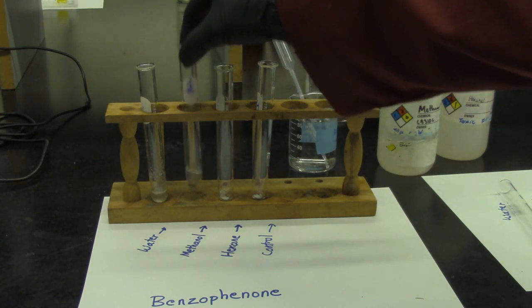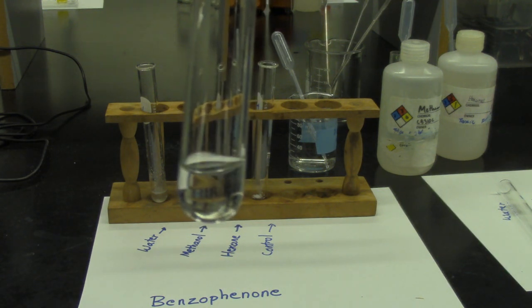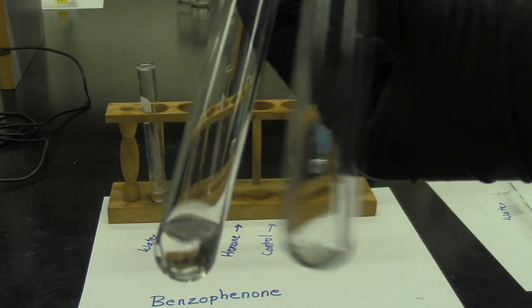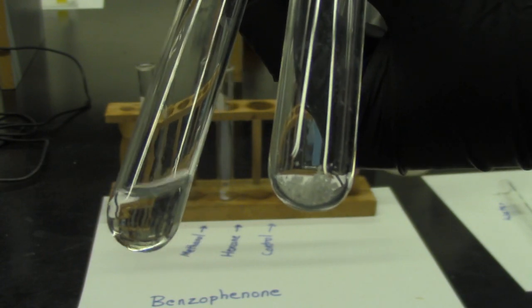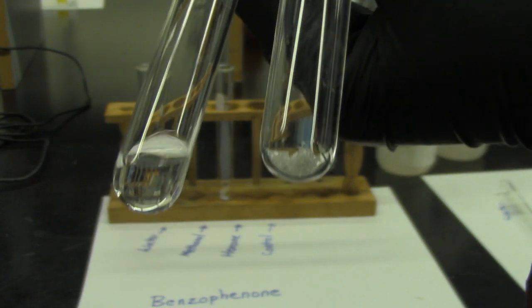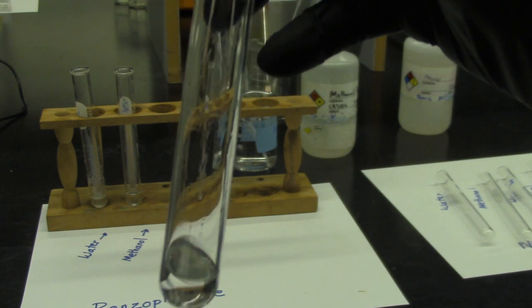To test tube number 2, I've added methanol and stirred for 60 seconds. Write down the observation. Compare with test tube number 4 again, which is the control. The control has the solid, and test tube number 2 is a clear solution. This is test tube number 3.